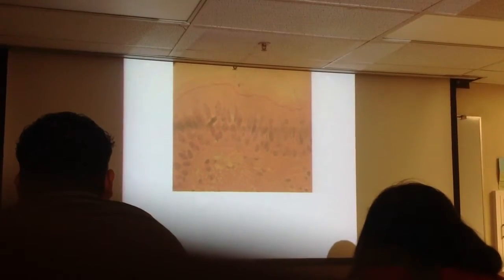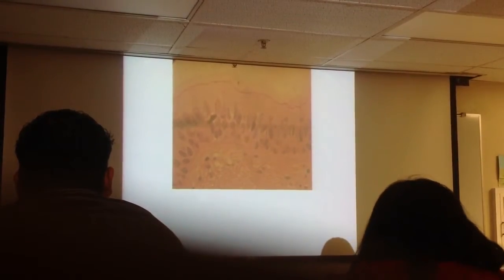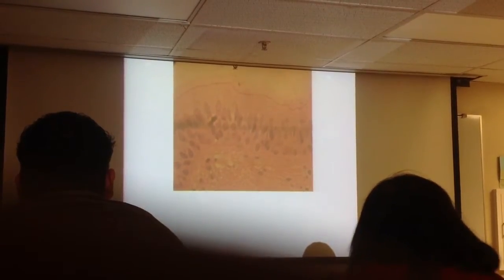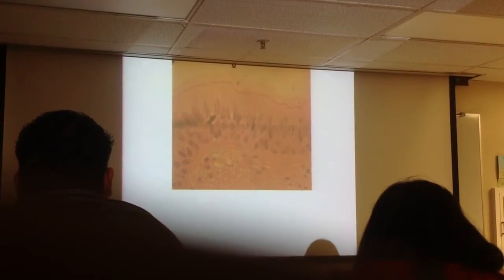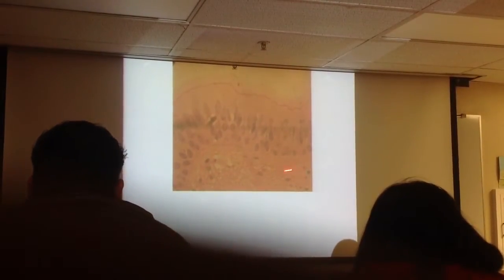What type of tissue is that? Pseudostratified. Easy to spell. PCCE. Pseudostratified ciliated columnar epithelial tissue. And what organ is that? Trachea. Broad category of tissue down here?